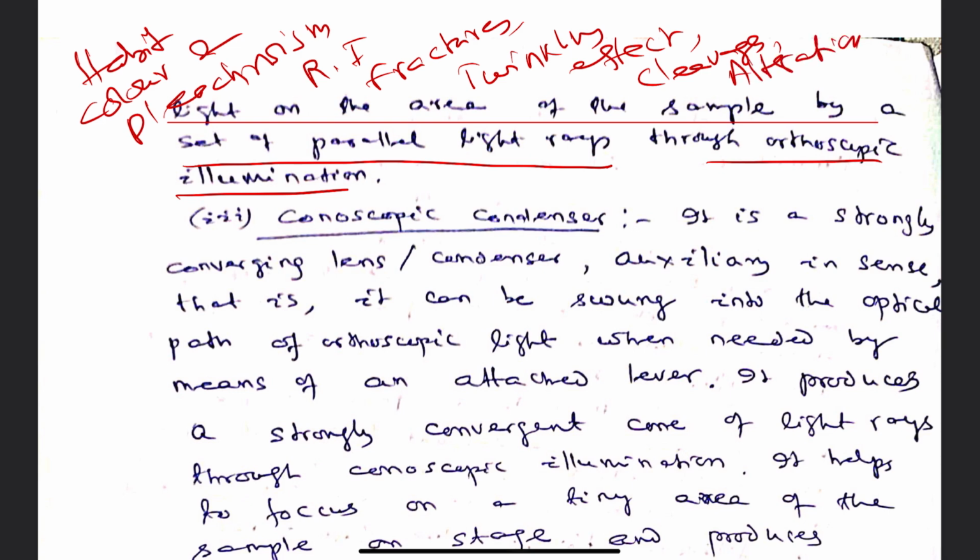These are some of the properties which are being studied by orthoscopic illumination, where convergent polarized light is not required.